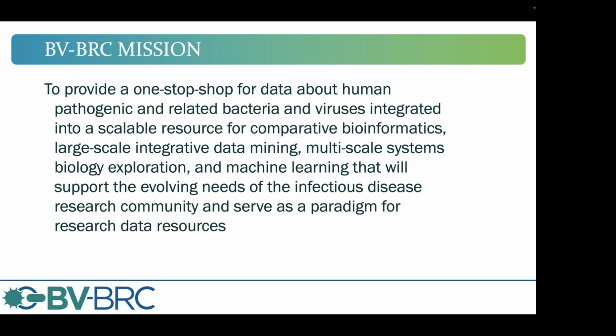So if you're new to the BV-BRC, we are here to provide a one-stop shop for data about human pathogenic and related bacteria and viruses into a scalable resource for comparative bioinformatics, large-scale data mining, multi-scale systems biology exploration, and machine learning to support the evolving needs of the infectious disease research community. And we're supported by NIAID to do that, and we are here to make the BV-BRC as useful as it can be for you, so please feel free to give us any feedback to make the BV-BRC even more useful for you.